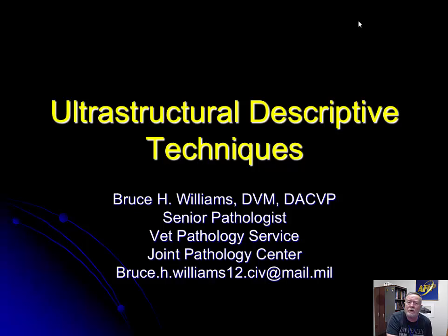Well, hello there. It's Bruce Williams again, and today I want to start a series of lectures on ultrastructure. I've been giving this lecture for about 30 years, and for many years it was a mainstay of the AFIP and now the Davis Foundation's Descriptive Veterinary Pathology course. That was back when the ACVP valued description and ultrastructure.